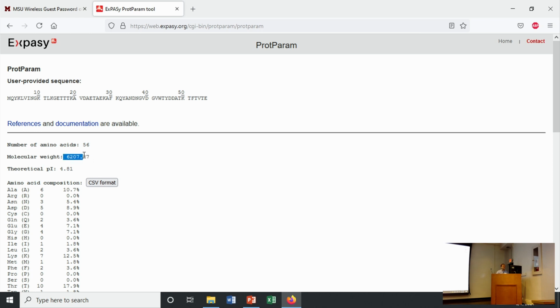And so, again, this is accurate enough. This is using sort of the standard natural abundance. And so it's not going to work if you're doing NMR labeling or isotope labeling, but we'll talk about that in a second. But this is accurate enough that I can go into our mass spec, and if I use the high res, it'll be accurate to within 1/10 of a mass unit. If I use our low res mass spec, it's usually 1 or 2 mass units. So it's pretty darn accurate.